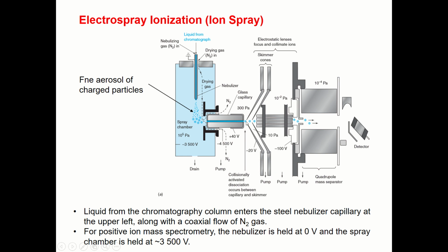And here at this part, collisionally activated dissociation occurs between the capillary and the skimmer. Okay, you will see soon.